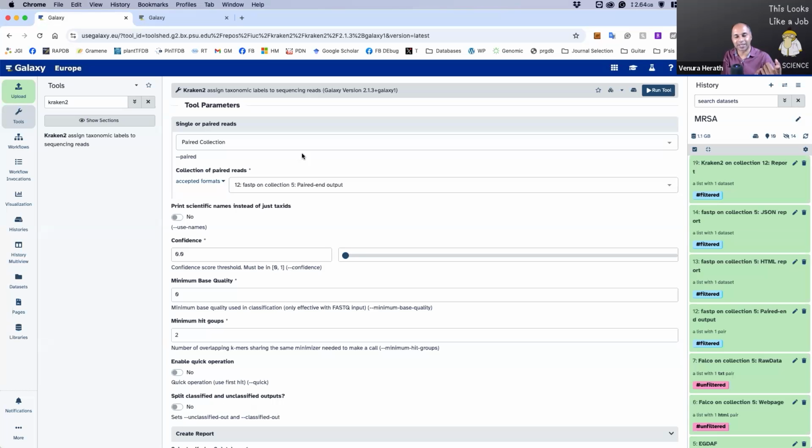Then it will tell you what kind of species it is. Whatever number, starting from, let's say, 1279, that is the taxonomic ID. So what you need to do is find what species corresponds to that specific taxon. Got it? Yes, sir. Thank you, sir.